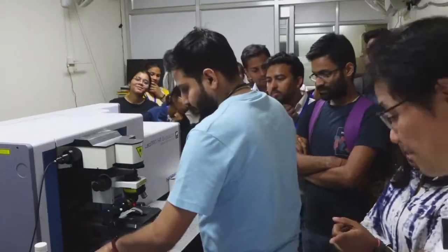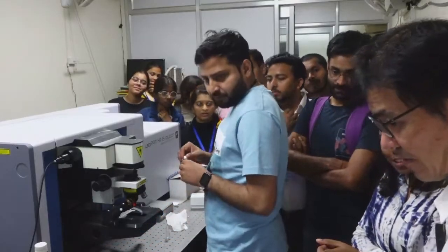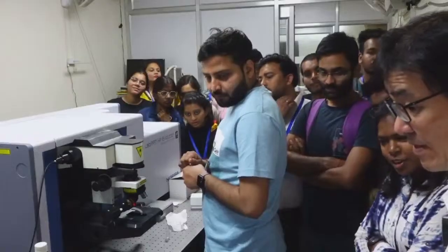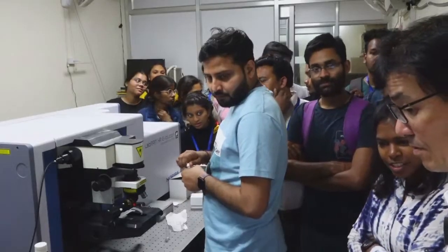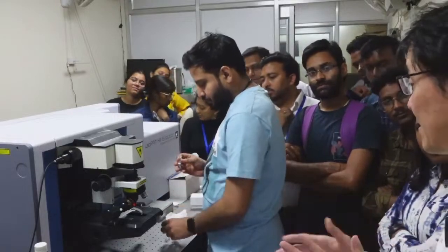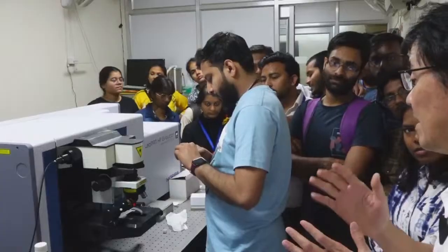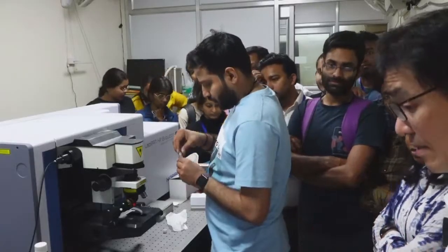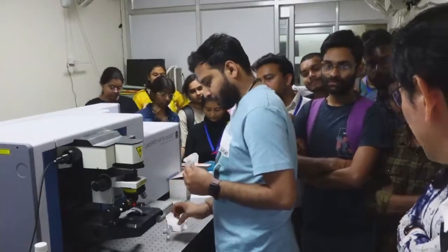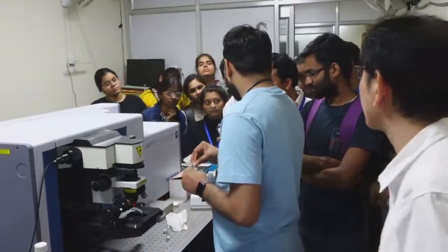Sir, is it okay if such a peak exists in the final data while sending for publication? No. During the data analysis, you have to repeat the experiment. By repeating the same experiment and increasing the accumulation number, you can remove it. How can we analyze these types of spectra?